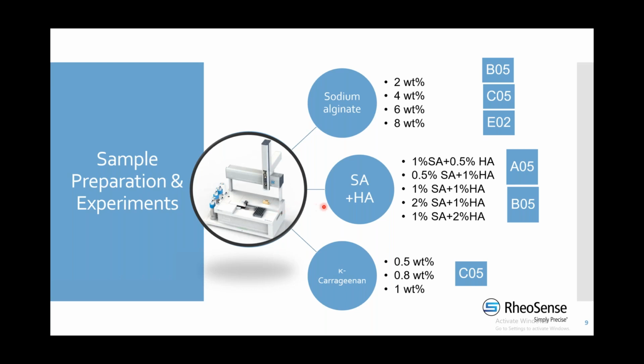Sorry, just a quick comparison of the chips for those who are not familiar with our instrument. For example, in the BO5 chip, the channel depth is 50 micrometers, and for EO2, the channel depth is 20 micrometers. The letters A, B, C, and E reference the max pressure capability of the MEMS pressure sensors.